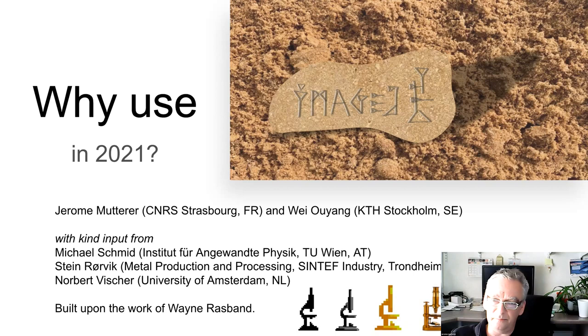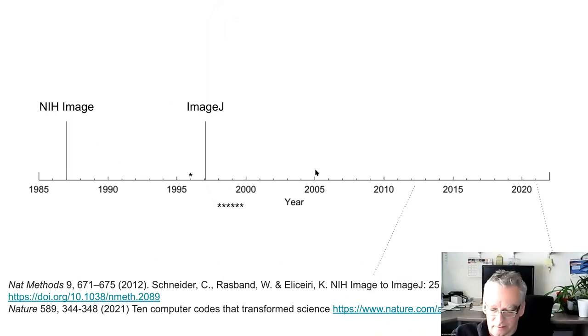And as you can see, I found the most ancient artifact about ImageJ, the first version of ImageJ. It is here. And it's known to be a very old software, and we might wonder if it's still worth using.